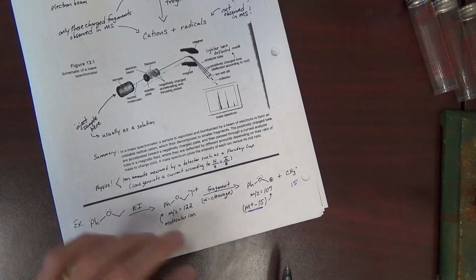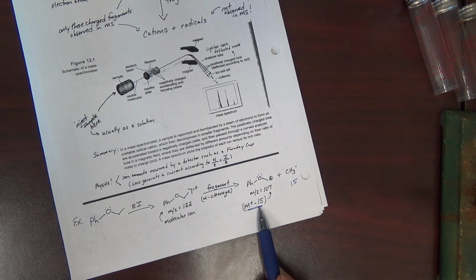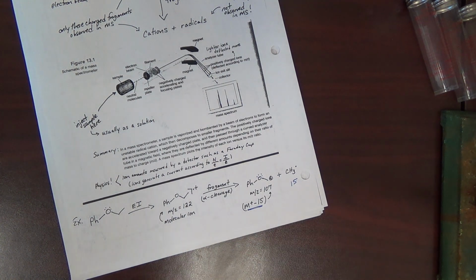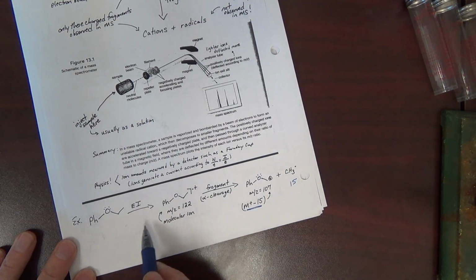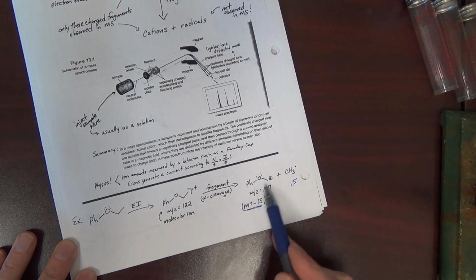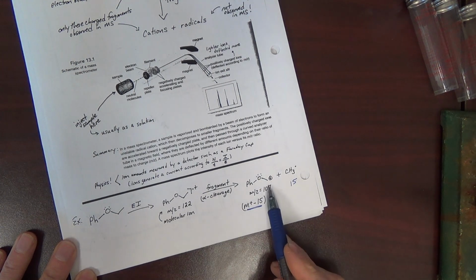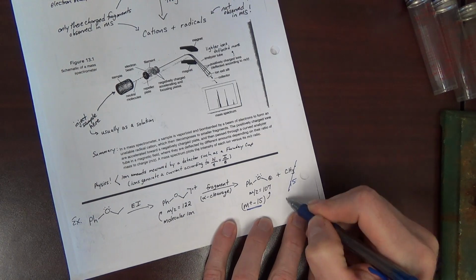And this is a common way to describe this because it's quicker. Then you can say, okay, what is M minus 15? Well, if it's 122, 122 minus 15 equals 107. And so for this molecule, we would look to have a signal on our mass spec at 122 for the molecular ion, but we would also expect to have a signal at 107 for this cleavage peak, or this fragment. We do not expect to have a peak at 15 because this is not charged, right?